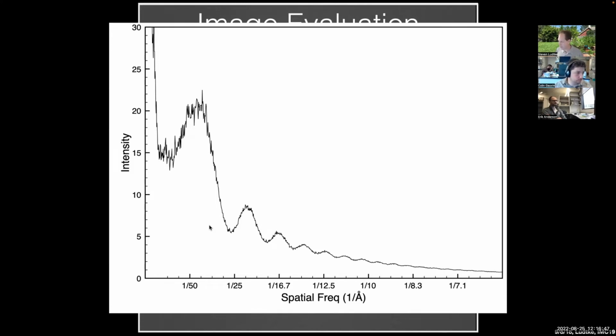Now, the shot noise that comes out of the imaging process and the noise that comes out of the detector is close enough to being flat band random noise that the assumption is fairly valid. Although usually it's not quite flat. Usually there's a little bit of a filter that's effectively been applied. So it's pink noise. It's been low pass filtered a little bit by the imaging process.